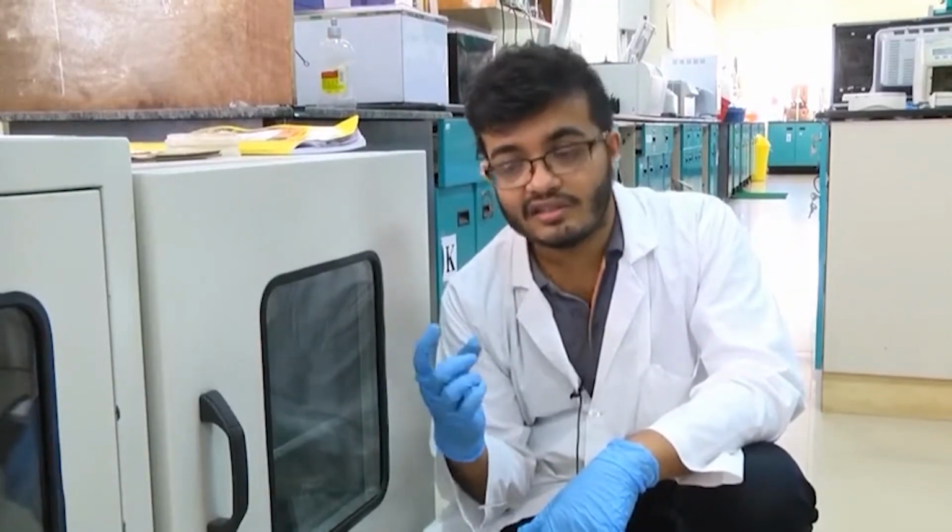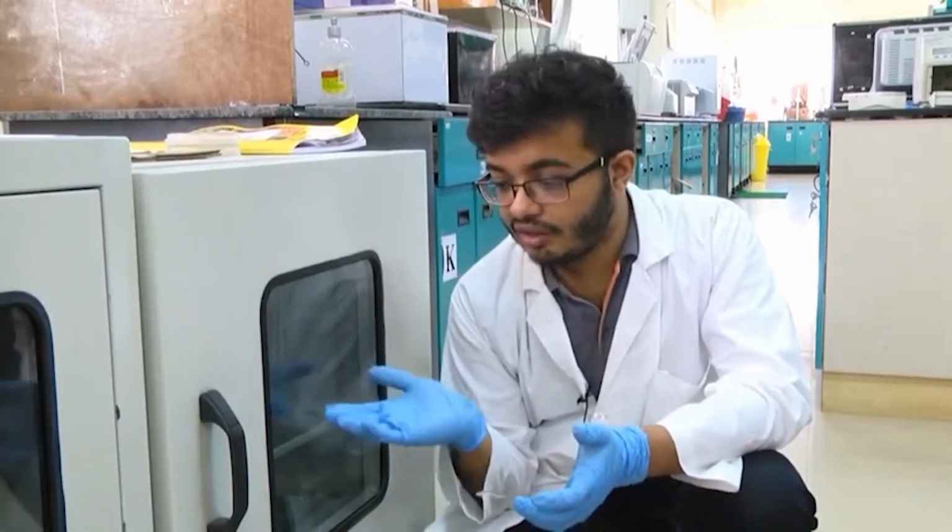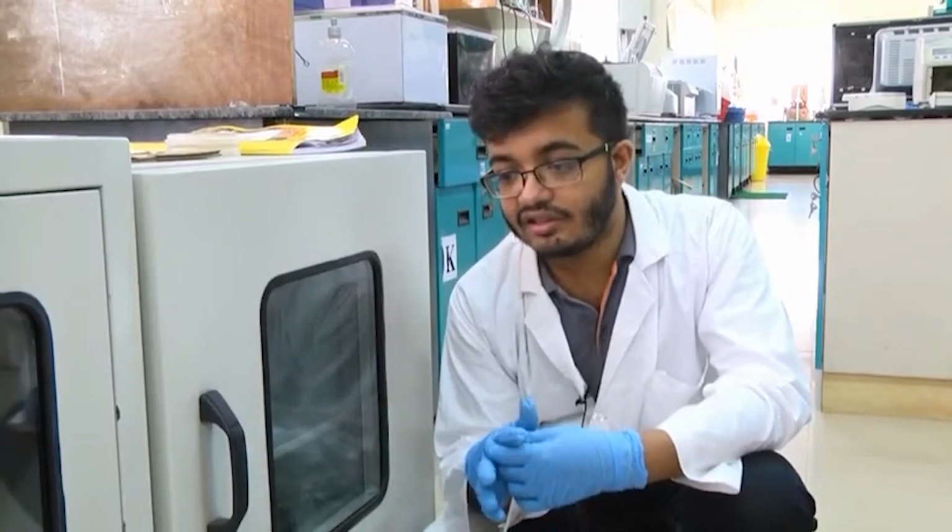Depending on what antibiotic resistance gene the plasmid encodes, you use an LB agar plate containing that exact same antibiotic. We did that, and as I showed you just now, after growing them at 37 degree centigrade overnight, we have colonies.